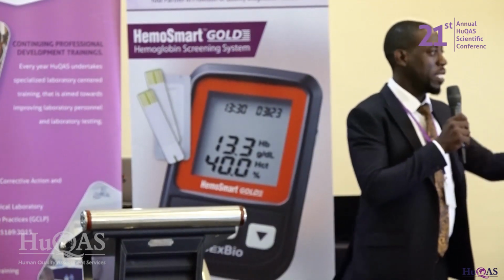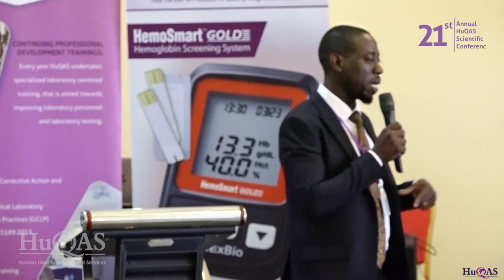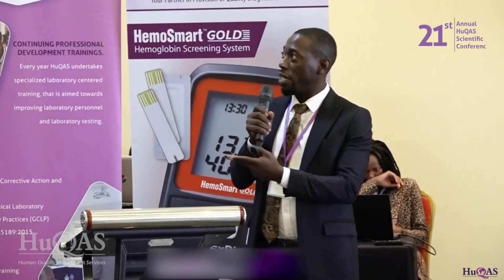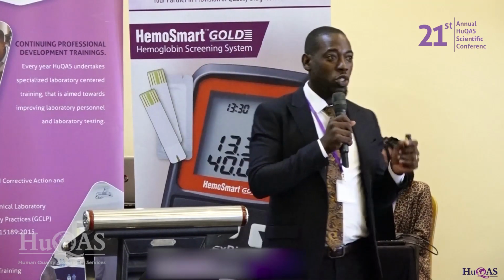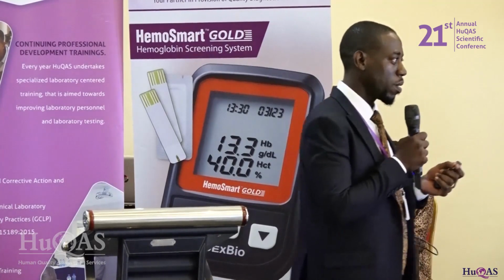So we also looked at the turnaround time. When someone comes and requests this sample, how long does it take to get these samples? But also the records associated with biobanking, the completeness of those records. These are our results. Using the SLIPTA checklist, the score was an average of 86% in terms of performance. And the 120 isolates which we had to retrieve, it took us 3 minutes.